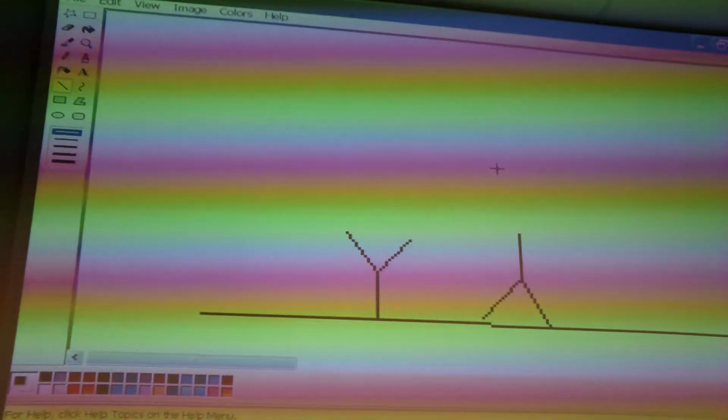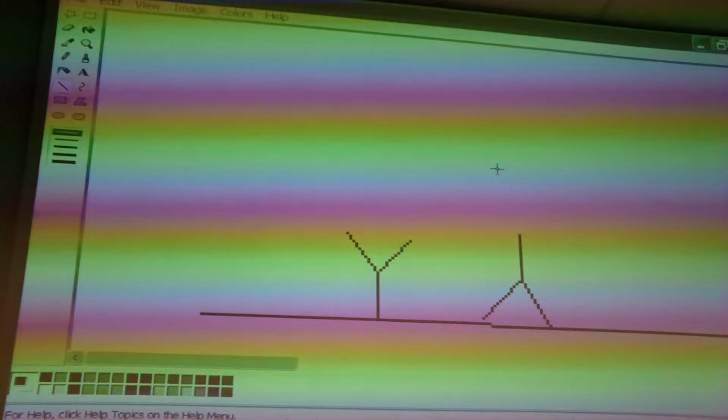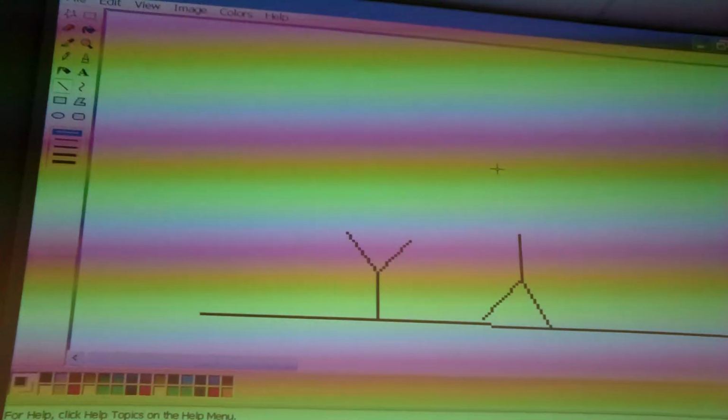So lots of it is going to bind the wrong way. Is that a problem? Can we prevent it? Not really. We just need to use a little more. The signal that we are going to find is going to be a function of how much protein we are able to coat. The more the better.